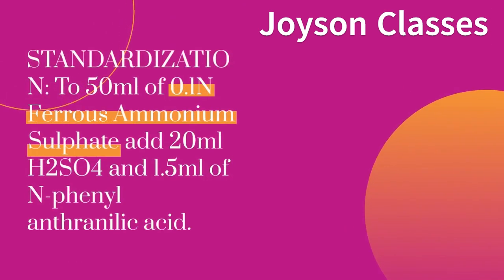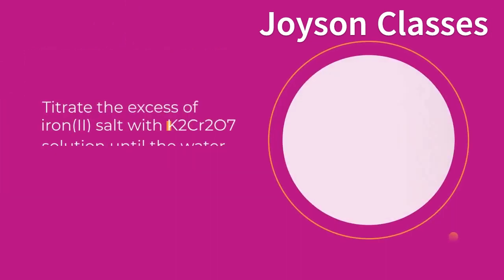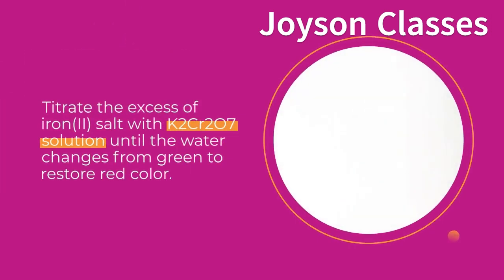Standardization: to 50 ml of 0.1 N ferrous ammonium sulfate, add 20 ml H2SO4 and 1.5 ml of N-phenylanthranilic acid. Titrate the excess iron(II) salt with K2Cr2O7 solution until the color changes from green to red. Endpoint: appearance of pink/red color.